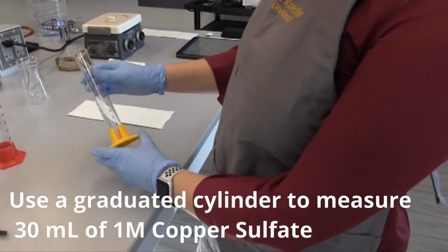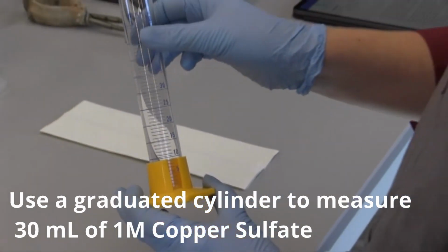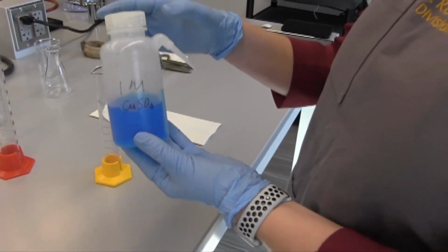Now we're going to use a graduated cylinder to measure out about 30 milliliters of 1 molar copper solution.